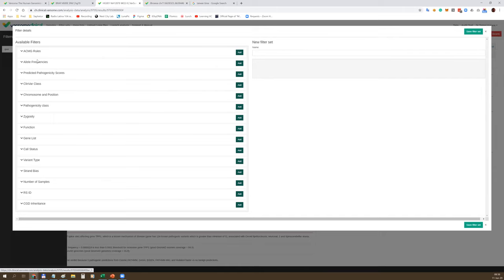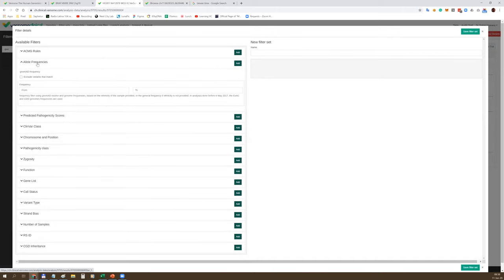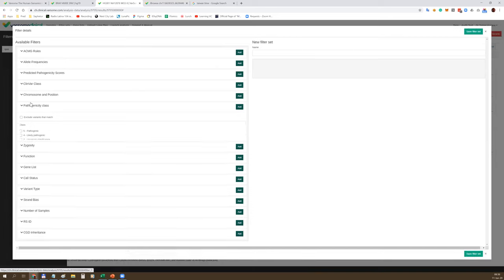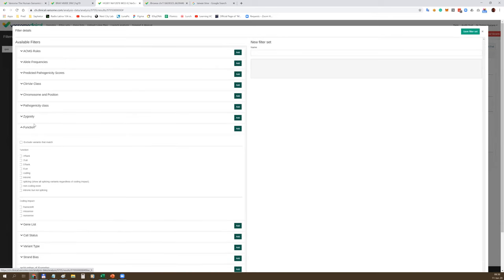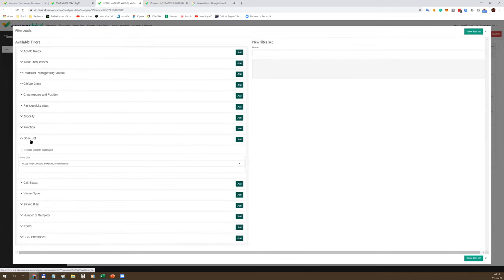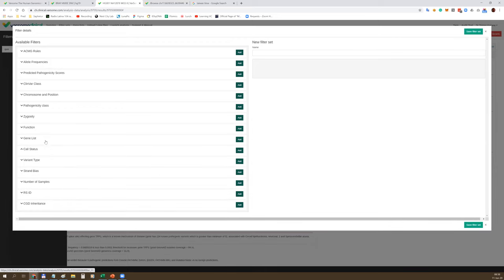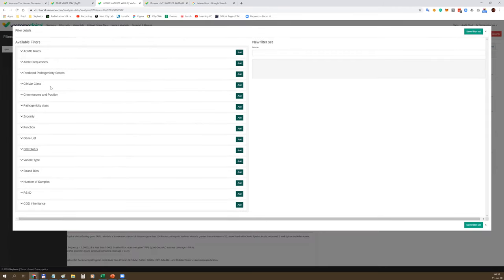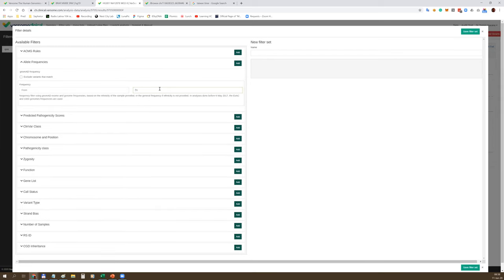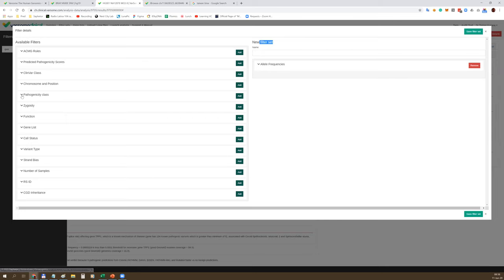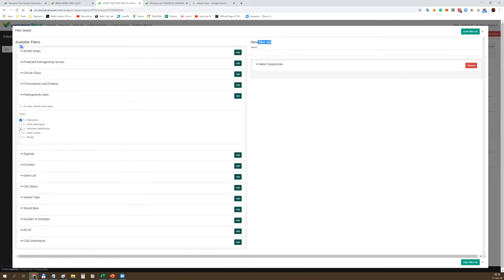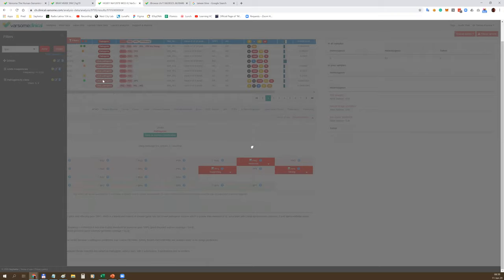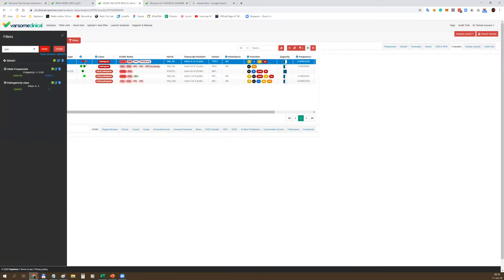Varsom Clinical comes with powerful filtering capabilities. On the left side, you can see the first kind of filters called dynamic filters. With dynamic filters, you can easily filter out your variants based on a number of criteria - based on ACMG, population frequency, ClinVar, chromosomal position, pathogenicity, zygosity, function, whether it's 5' UTR, splicing, coding, upstream variant. You can set up a gene list and use it as a filter, call status, number of reads, or allelic balance. Let's say we want to filter out only rare variants with a frequency less than 1%.